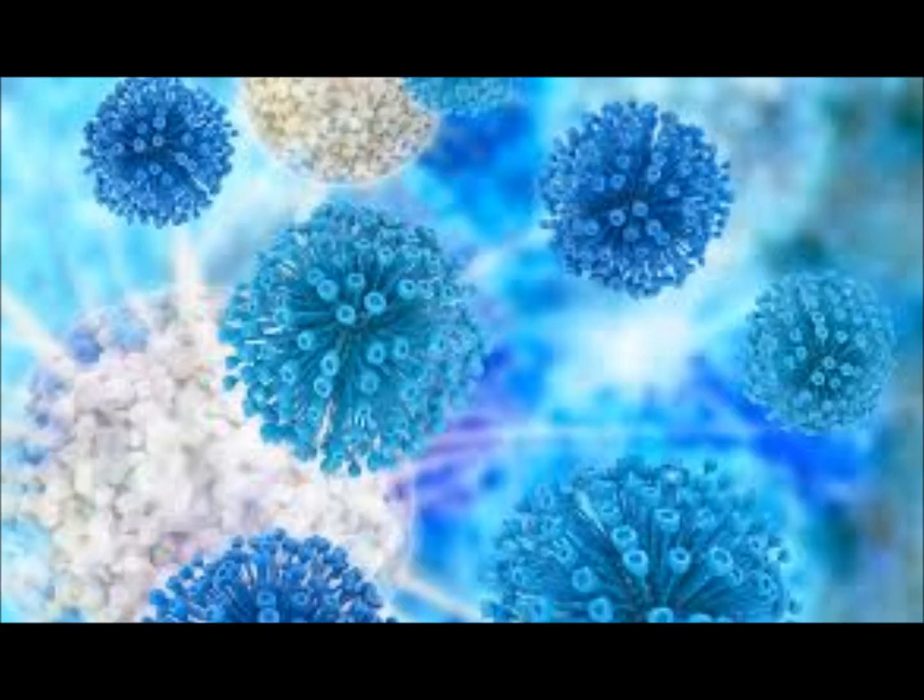And also culture site. Every lab is going to have maybe R, like on our gram stains that we've been doing from labs, we put R for respiratory, we've put B for blood culture, we've put G for genital, we've put W for wound. So they might have RESP, they may have SPU for sputum. You'll just have to learn how they identify on their plate what culture it is. U for urine. That's what also would have to go on a plate when you're working on a culture.